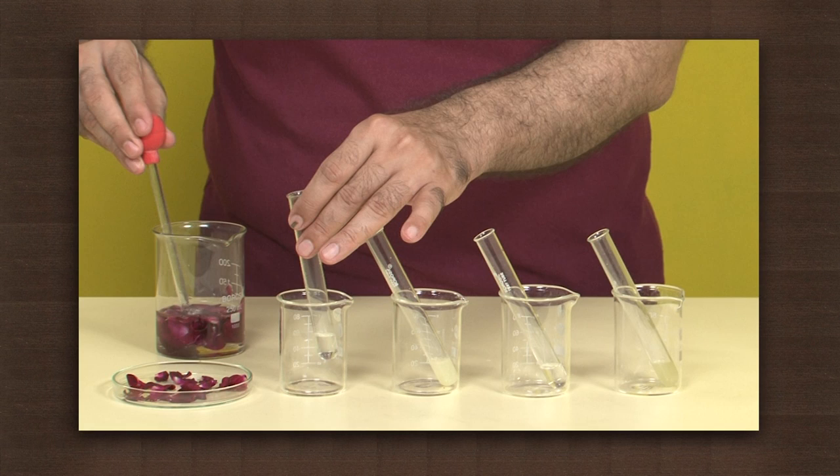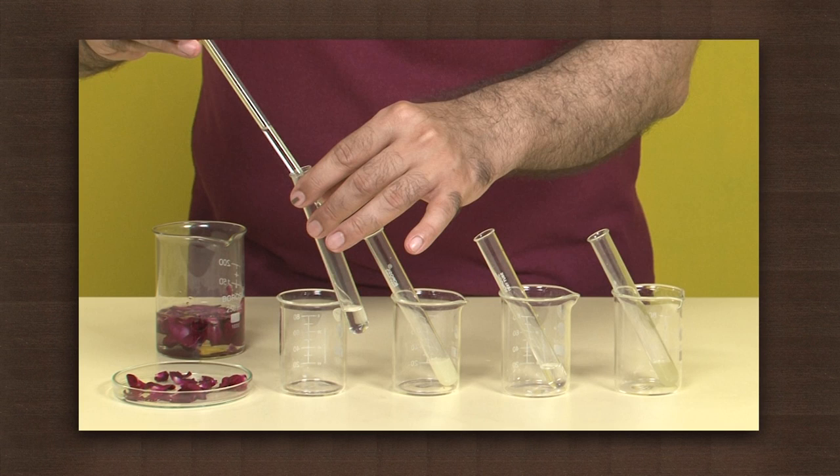Now add china rose indicator drop by drop to hydrochloric acid. Note the change in color.